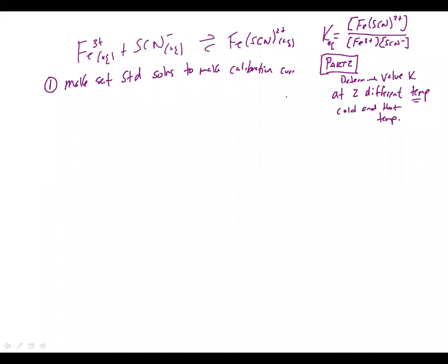Basically, we're going to set these up so that we have a set of standards of known concentration of our product.